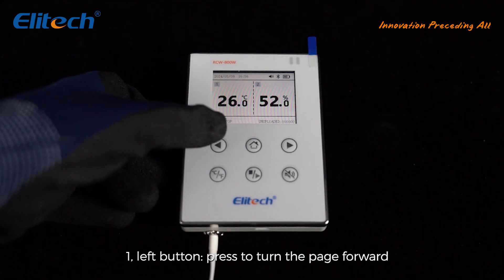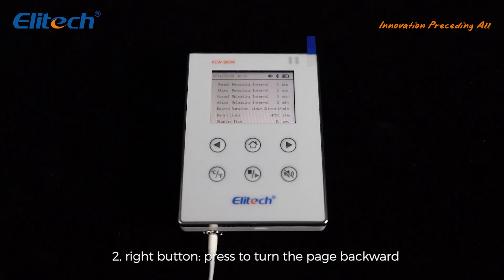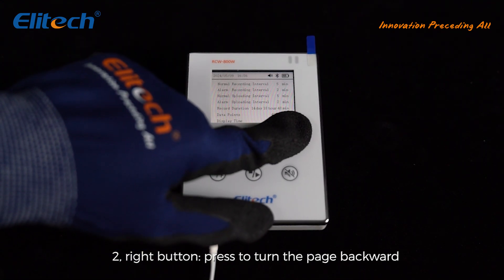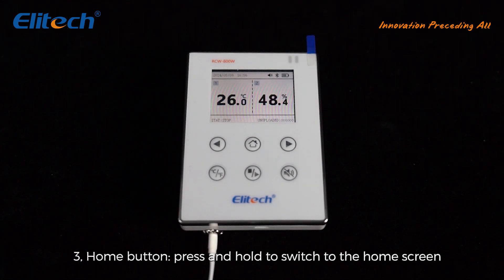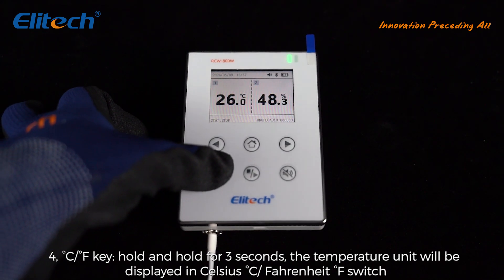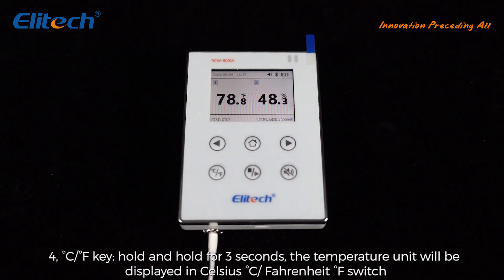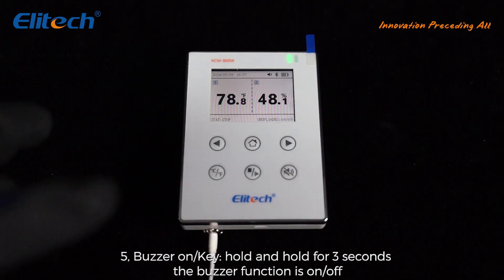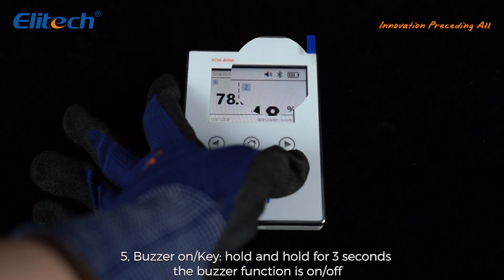Other key operations: 1. Left button — press to turn the page forward. 2. Right button — press to turn the page backward. 3. Home button — press and hold to switch to the home screen. 4. Degree C/F key — hold for 3 seconds to switch the temperature unit between Celsius and Fahrenheit. 5. Buzzer on/off key — hold for 3 seconds to toggle the buzzer function on or off.